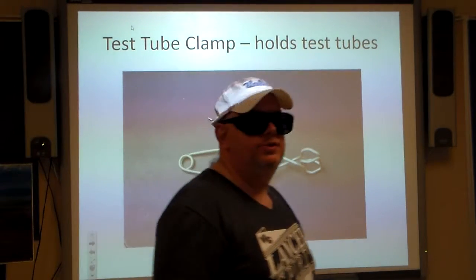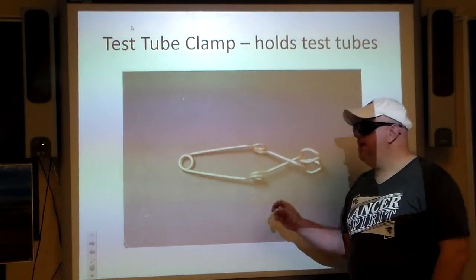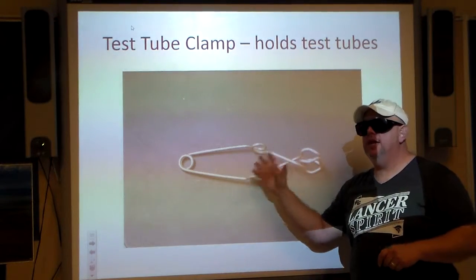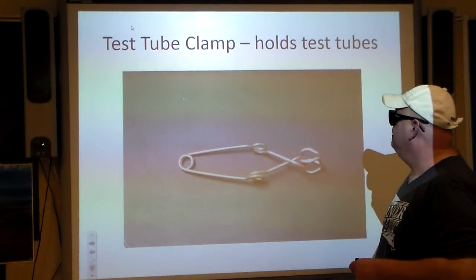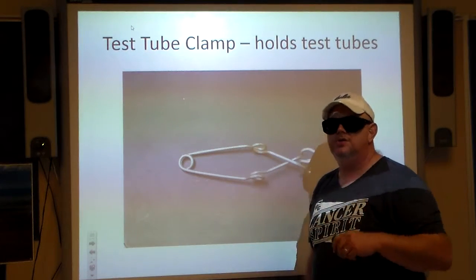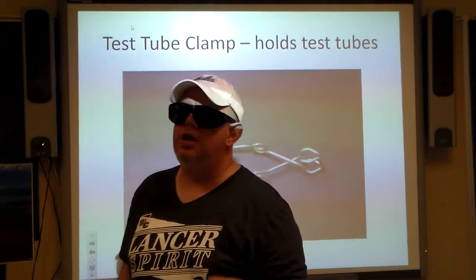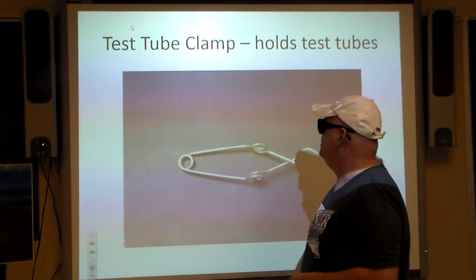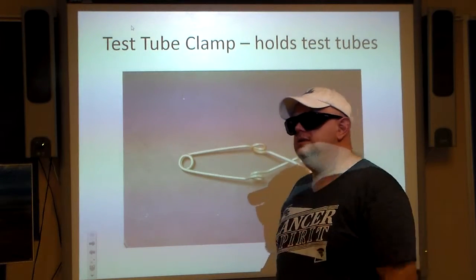Test tube clamp — guess what that holds? Test tubes. It's a piece of brass. You squeeze it, put the test tube in, let it go, and it will clamp onto the test tube. That's basically it. You do not use this to clamp it onto your ear — that's just going to make you look stupid in front of your friends.